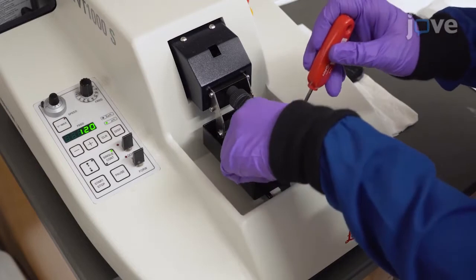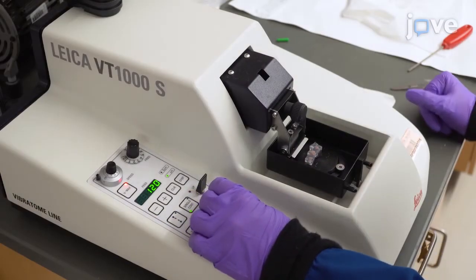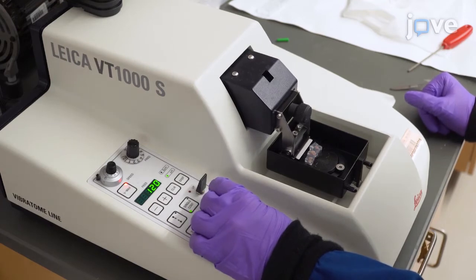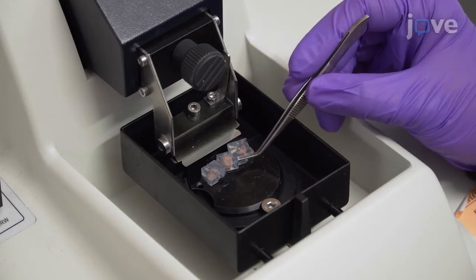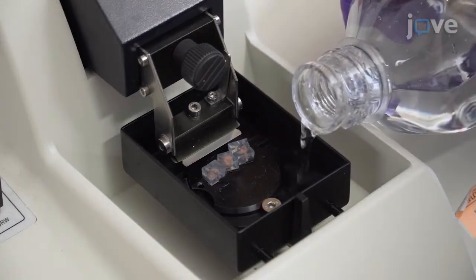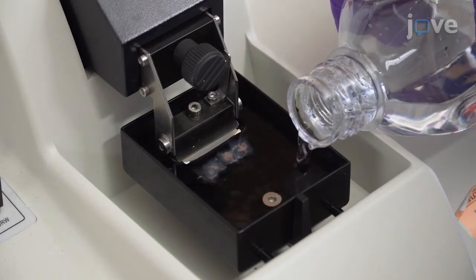Next, attach the plate to the vibratome with a screw and adjust the blade height and distance being traveled so that the blade moves over the length of the blocks and just barely above them. Gently nudge the blocks with the forceps to check that the glue has dried, and then fill the vibratome tray with a chilled extracellular solution until the blade is covered.